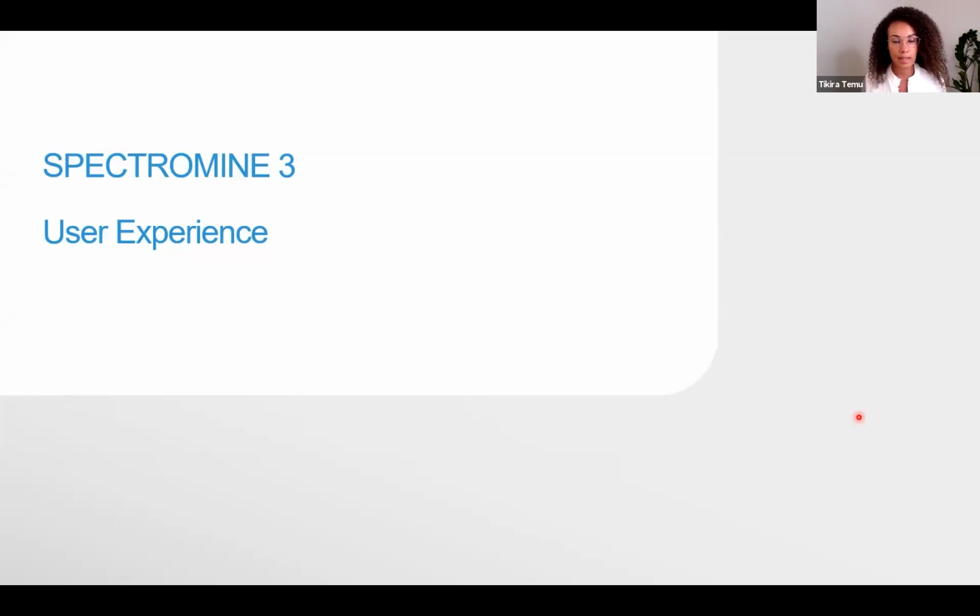And I think we can already have a look at the results. Okay, so that's quite nice to hear that you, as well as we, think visualization is quite important. And then you're also in for a treat on that part.